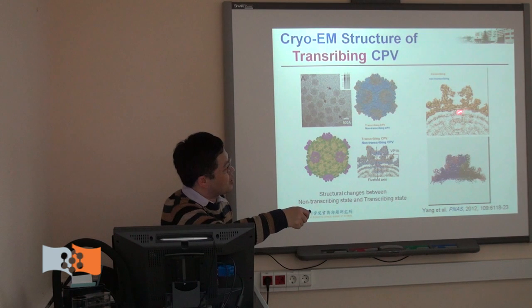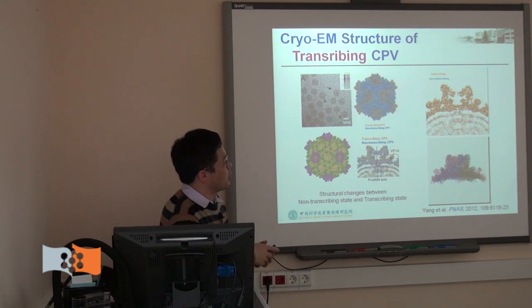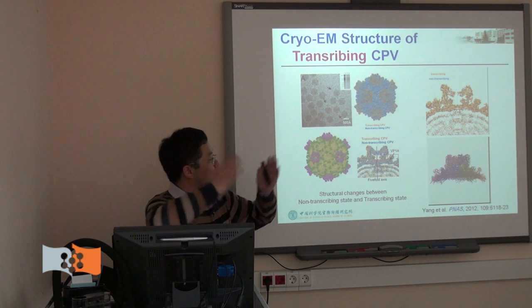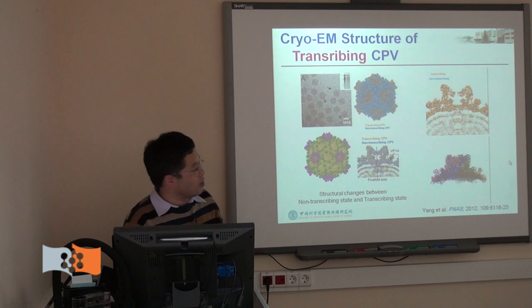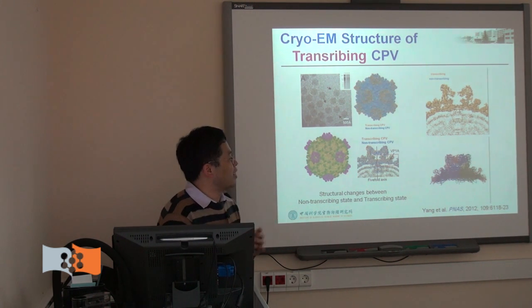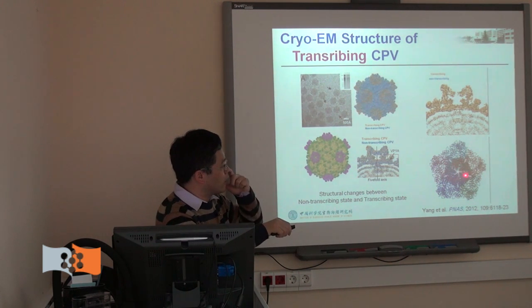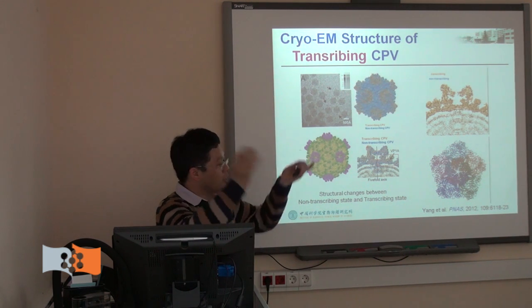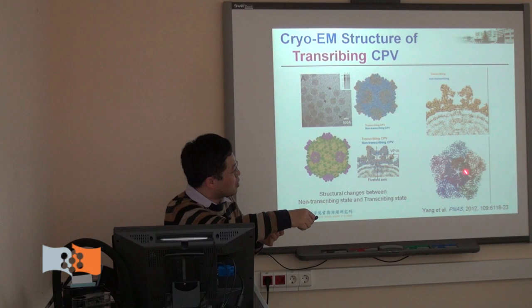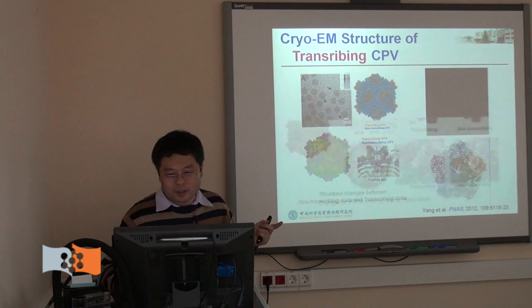And here we suspect this is RdRp, but we cannot get the real structure information. They are just like a flower getting open. But if we compare this atomic model together, it looks like the virus is a very tiny machine, but a very precise machine. To make the RNA get out, they have this RNA like a flower blooming, so they are opening and rotating a little bit. After this conformation change, the RNA is getting out. So this is what we think the model is.